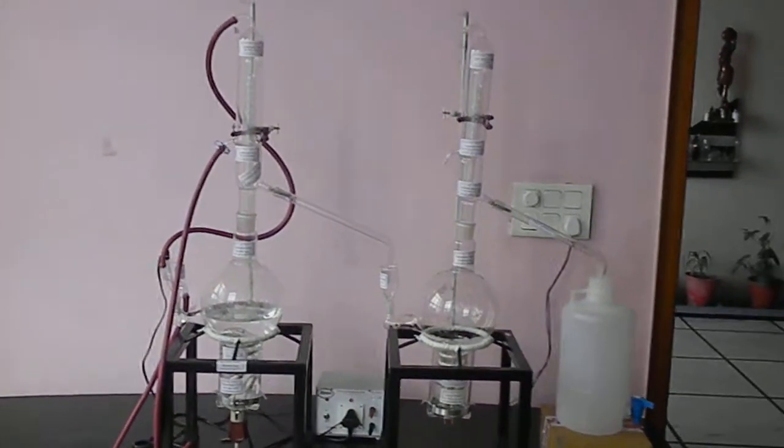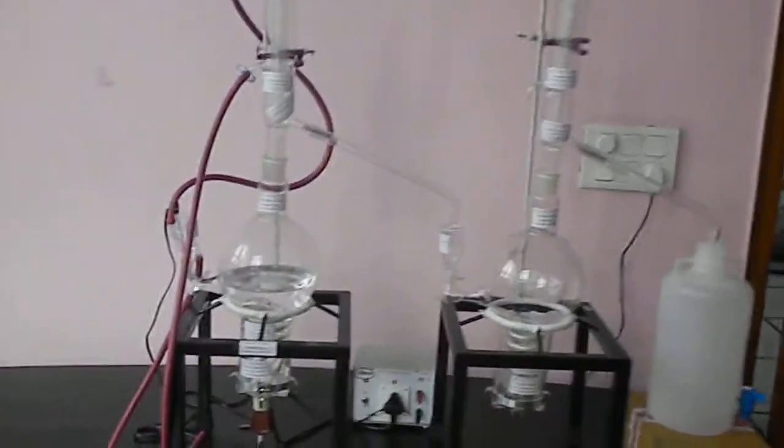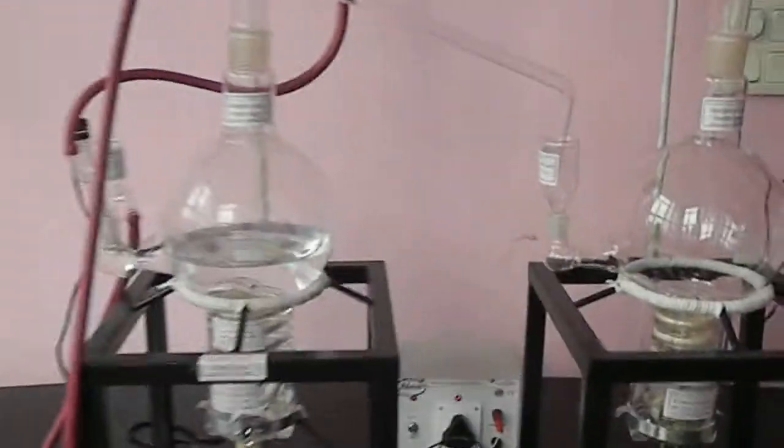This is a double distillation apparatus by Abranex Food. Now we have a system where the auto cut-off is provided.